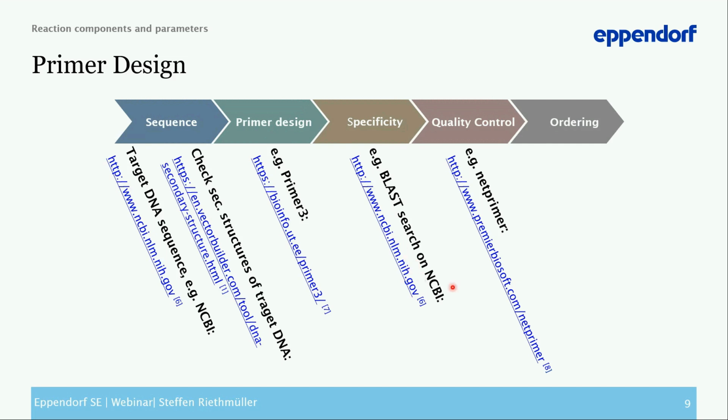And in the end, you can perform final quality control with a tool called Net Primer. And this also gives you a rating of your primers. And this is also a nice thing I could recommend here.